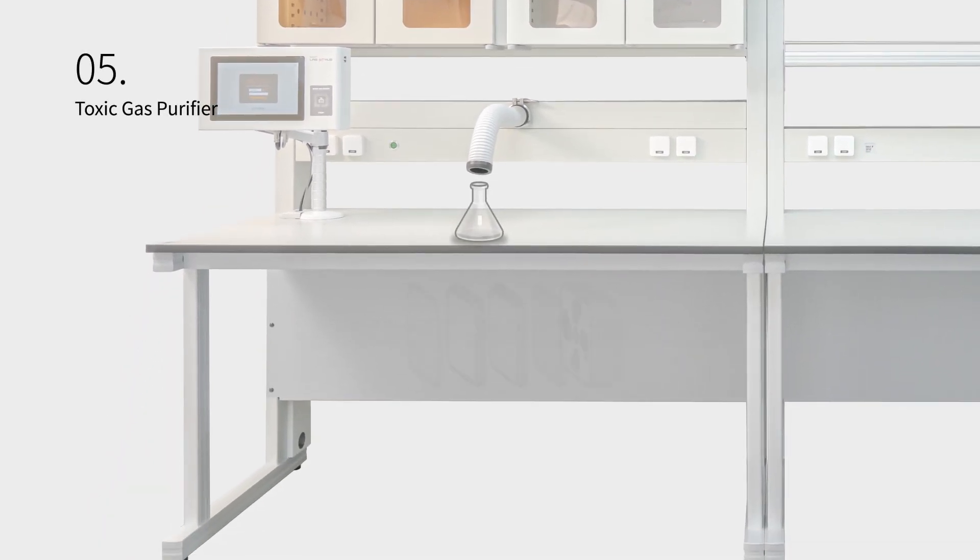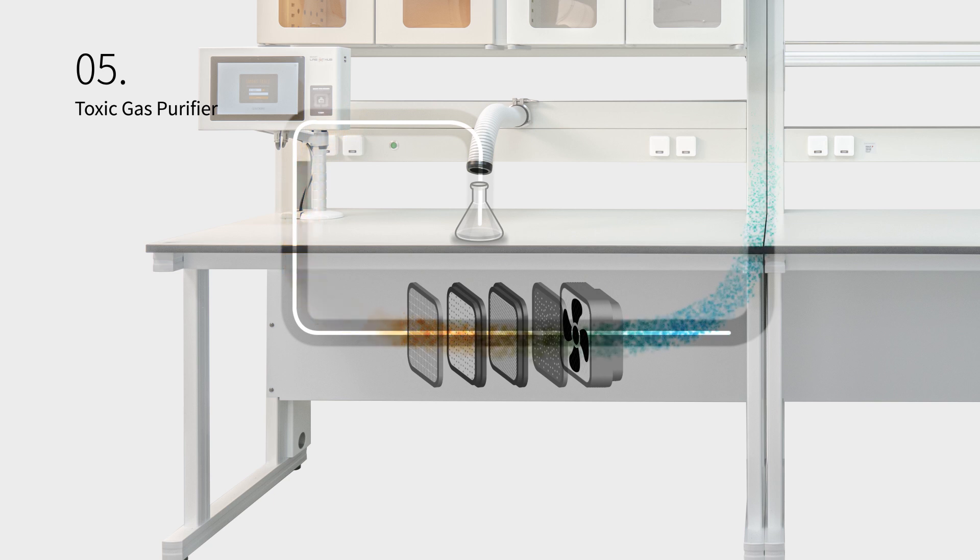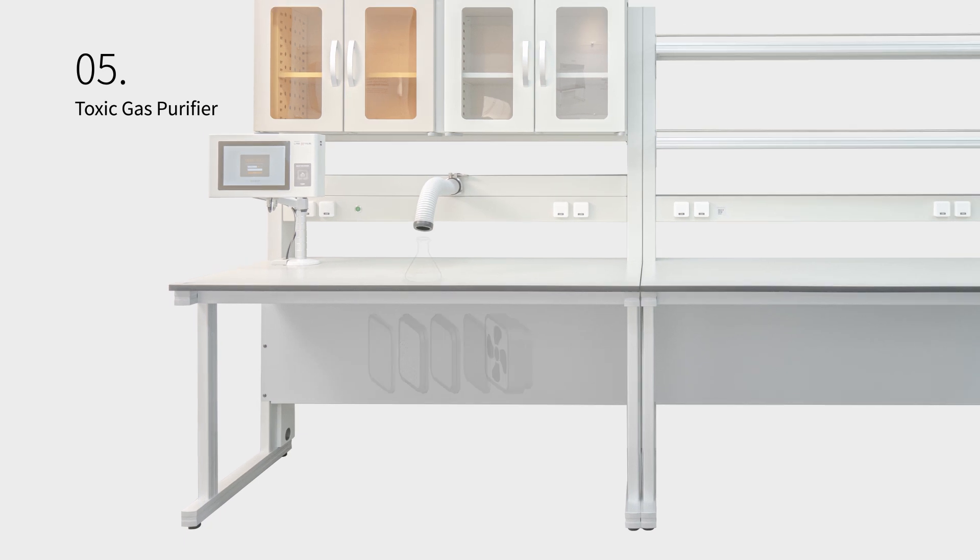GT Science powerful TOGA toxic gas purifier is built into the table, allowing researchers to easily, conveniently, and instantly capture and purify toxic gases as they are generated while working with toxic chemical substances, preventing researchers and other staff from chemical exposure.